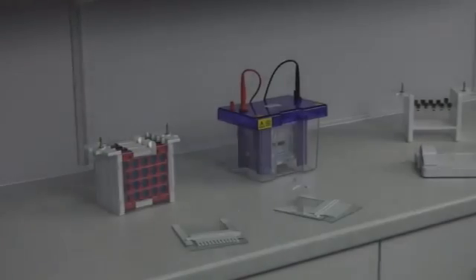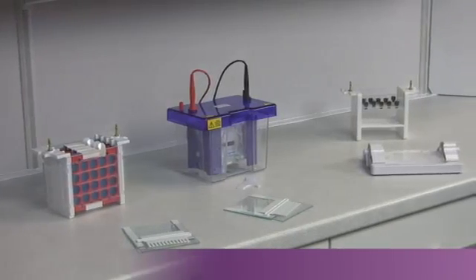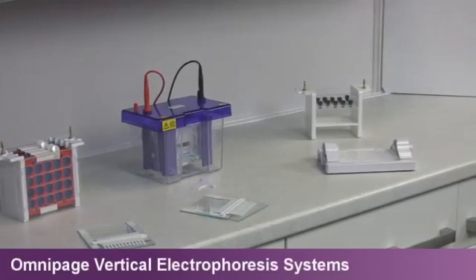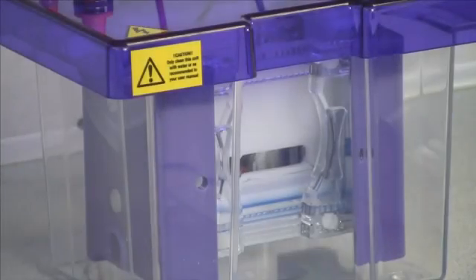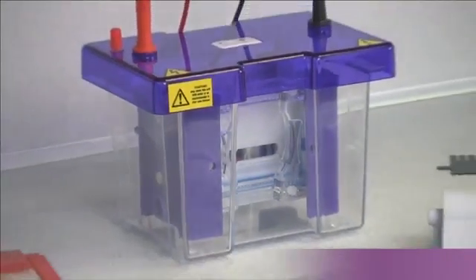Cleaver Scientific provides a comprehensive range of Omnipage vertical systems for all your protein electrophoresis needs. The most popular size format is the Omnipage Mini for 10 by 10 centimeter gels.